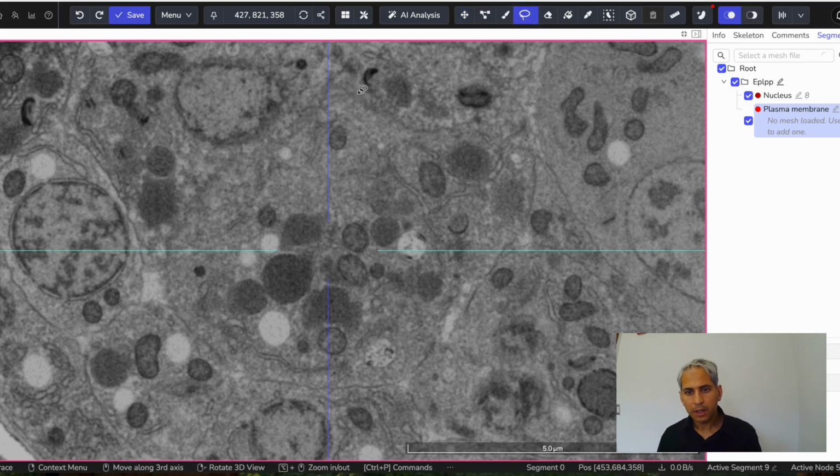And now I'm going to start from here and then go down around what I believe is the plasma membrane by 2 criteria. It's dark gray tone compared to its surroundings, and if there's a gap next to it, for example, I'm coming up to a gap between cells, I'd say my plasma membrane is on this side of the gap.